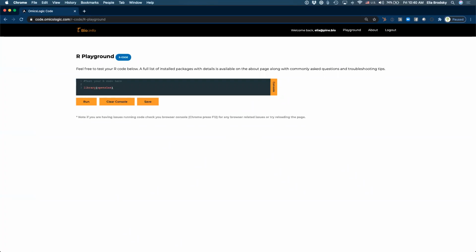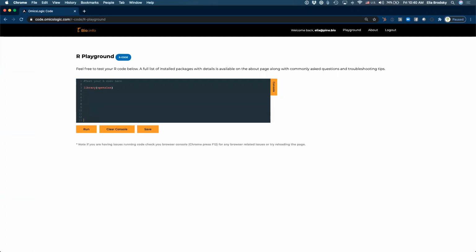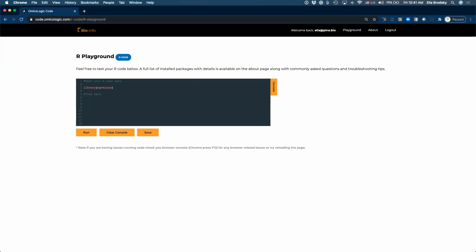Okay, so that's the first thing that we're going to put here. Then we're going to load our data.